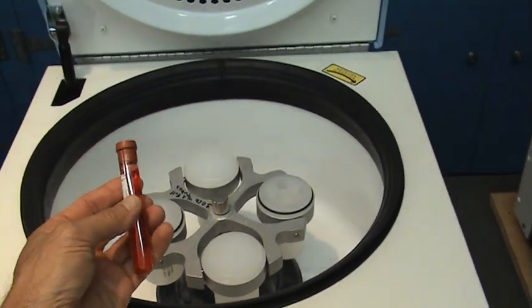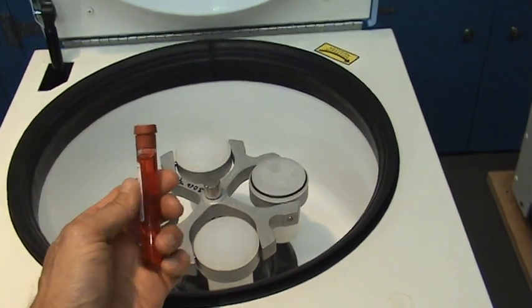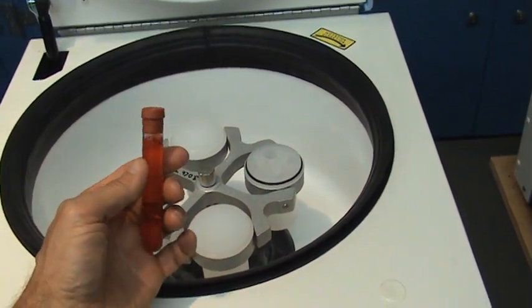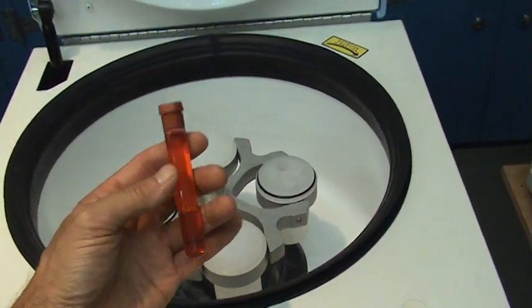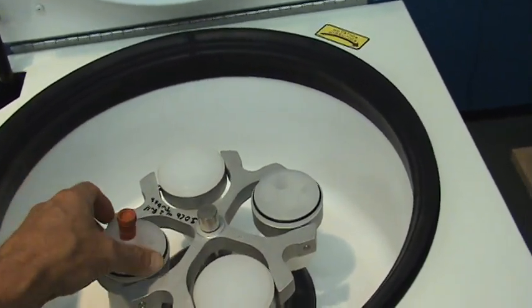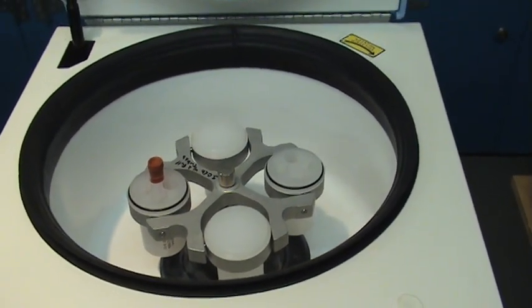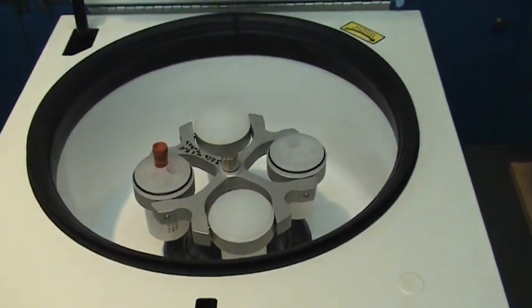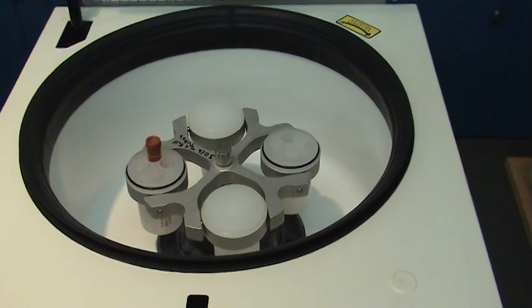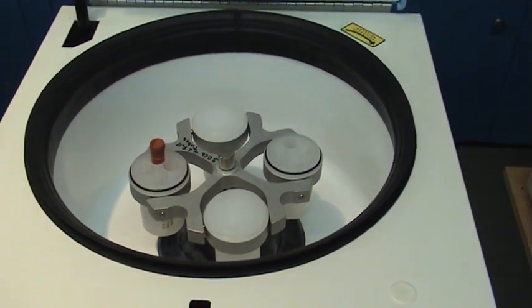If we load this centrifuge rotor with this specimen tube, this is a 10 milliliter plastic tube with colored water. As you can see it's quite full. If we load this into one of the positions on the rotor, this tube weighs about 20 grams. You'll quickly see that this centrifuge is not capable of tolerating this imbalance.